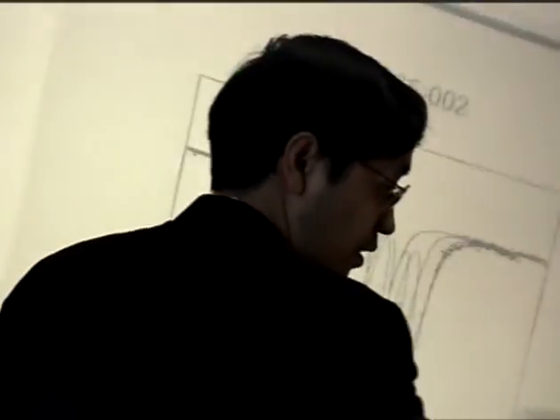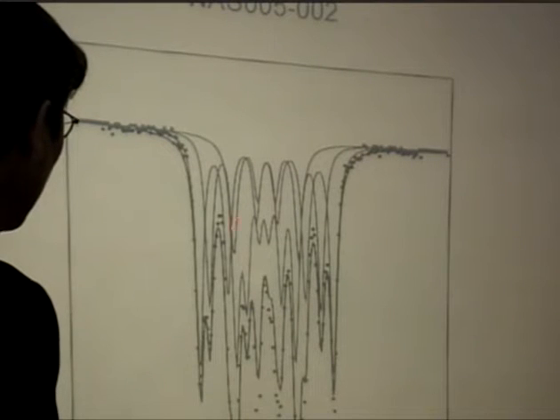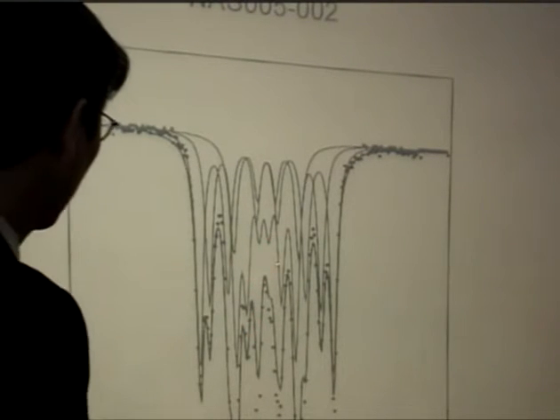That's the sample spectrum from the Mössbauer analysis. That's the first sample we took, about 2 hours after the start of reaction.